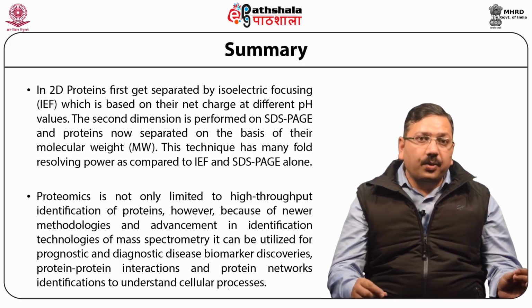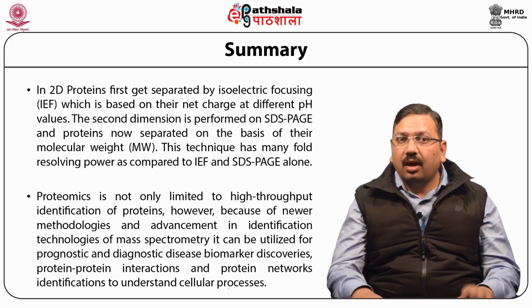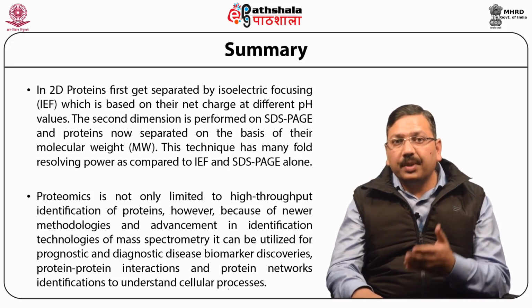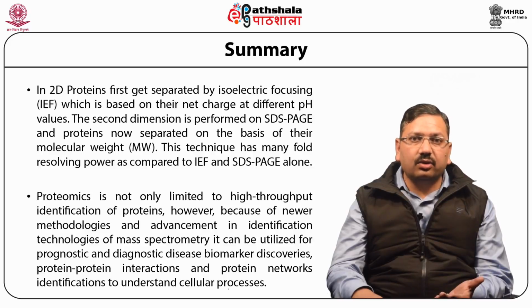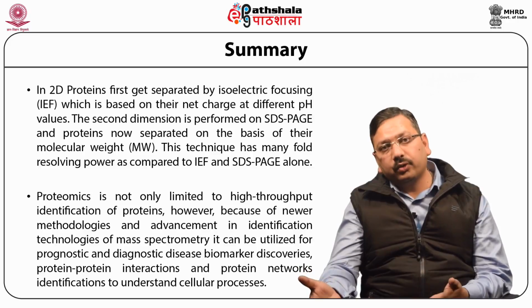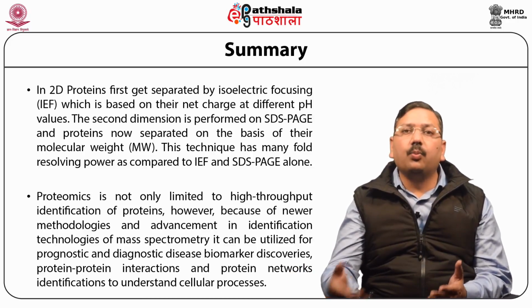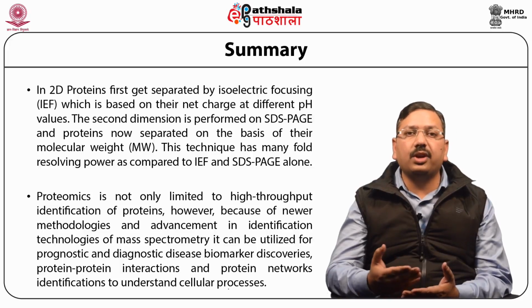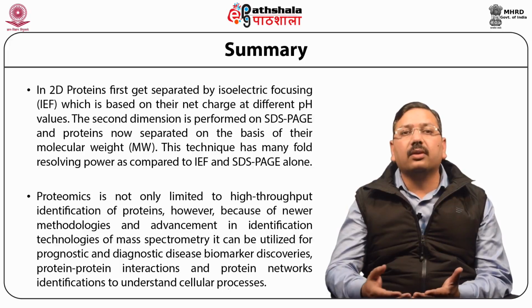Okay, proteomics is not only limited to high-throughput identification of proteins. However, because of newer methodologies and advancement in identification technologies of mass spectrometry, it can be utilized for prognostic and diagnostic disease biomarker discoveries, protein-protein interactions, and protein network identification to understand cellular processes.